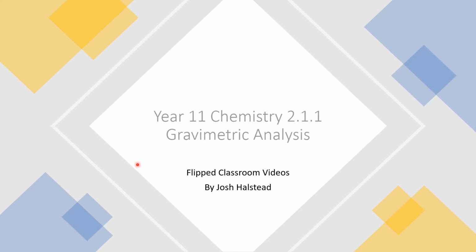Now, to do that, what we'll be doing first is looking at some gravimetric analysis techniques. You may have done some of that already in the separating mixtures practicals that you would have done in module 1, but I wanted to go through an actual practical, a simple reaction, and show you some of those gravimetric techniques, because when we're in the lab, one of the ways in which we can actually measure different substances and how much they are is by mass.